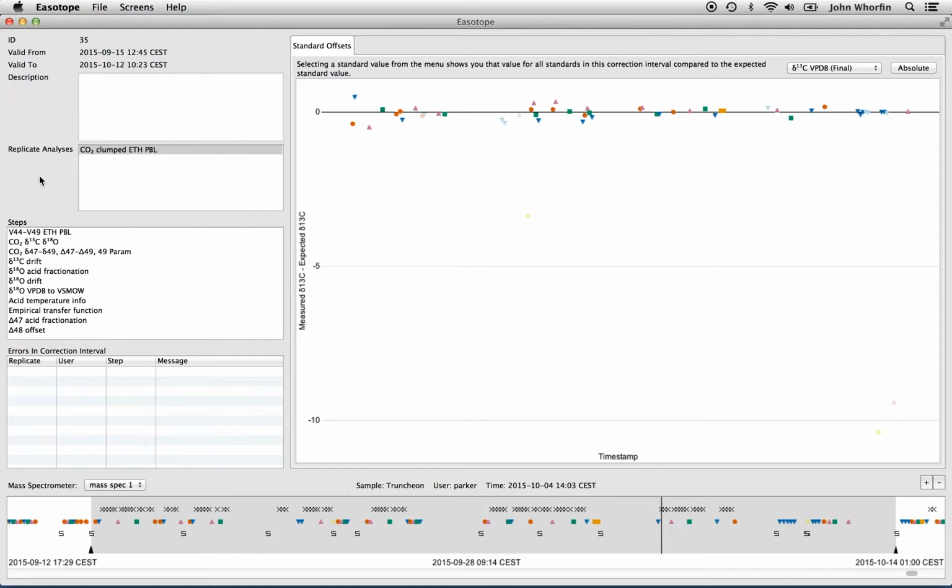So imagine you've imported data from your mass spectrometer. You have a large table of voltages. Each of these steps is then given those voltages, and data is added to the table by the step. So the step might decide to add a new column, calculate some numbers and add that. Then the next step will do the same thing, calculate some numbers and add to it. So with the execution of each of these steps, your table is growing and growing and growing, and you're getting more and more values in the table.